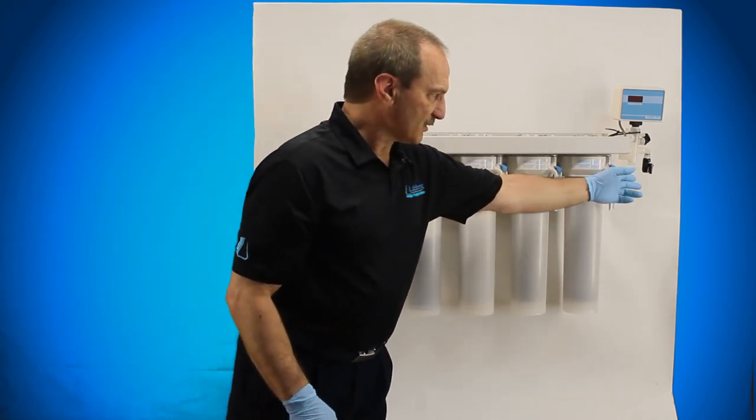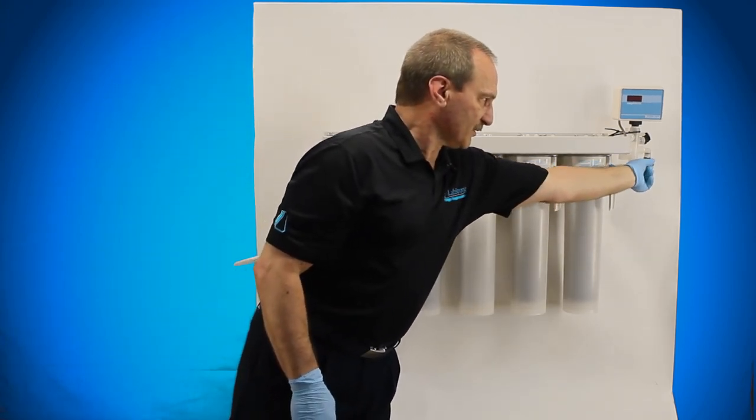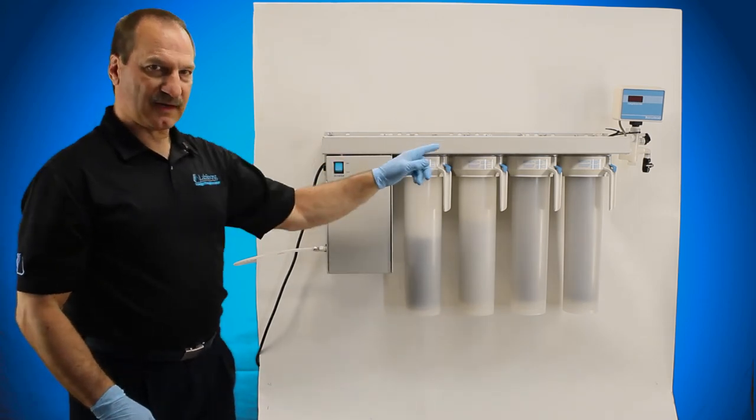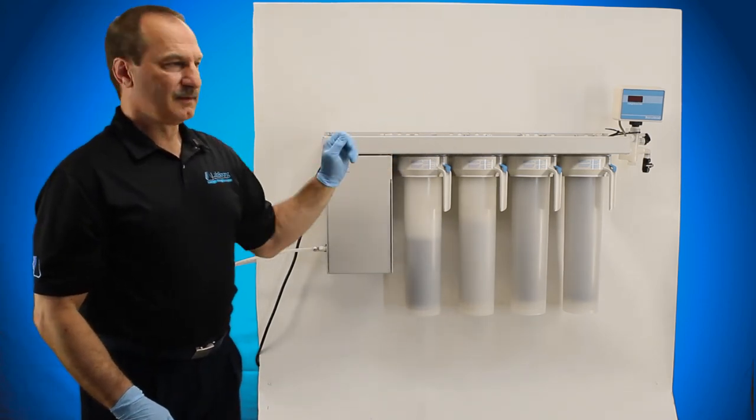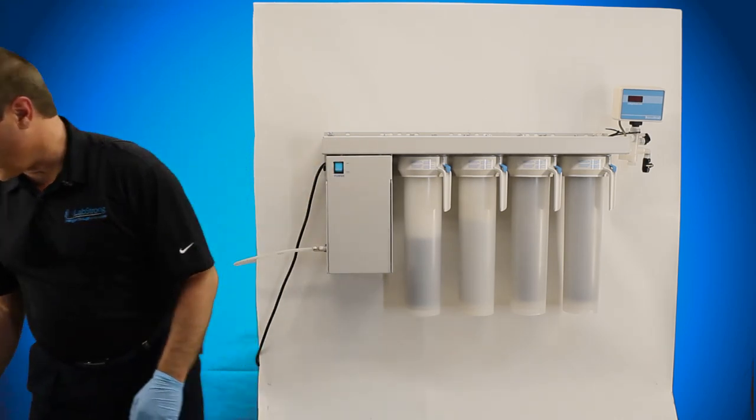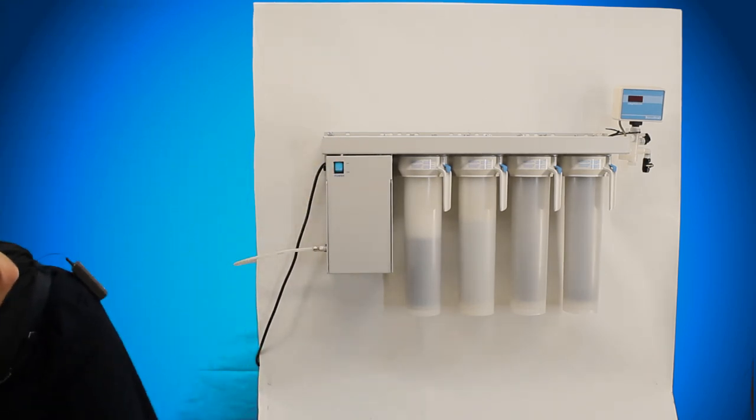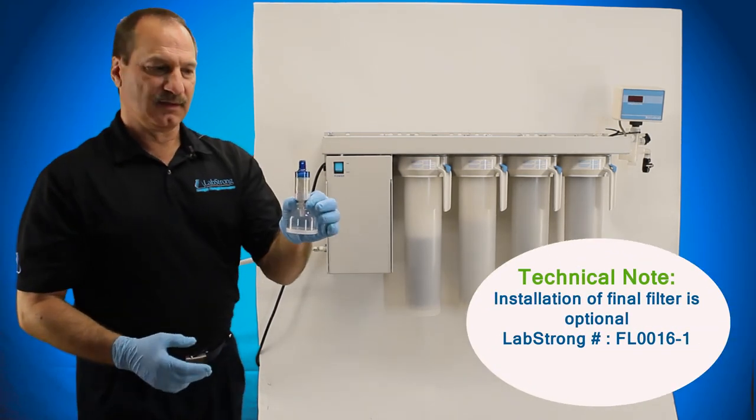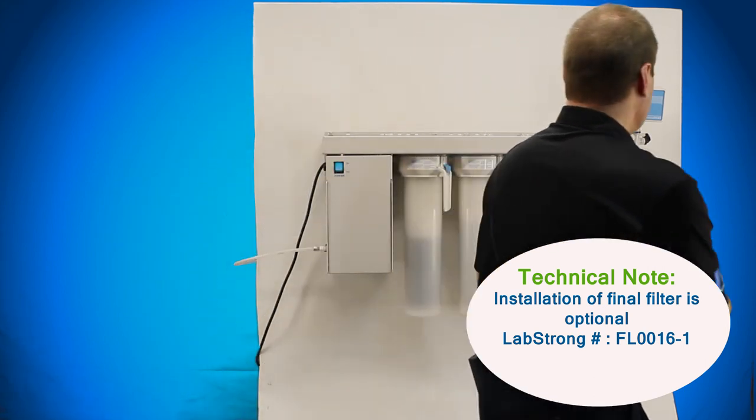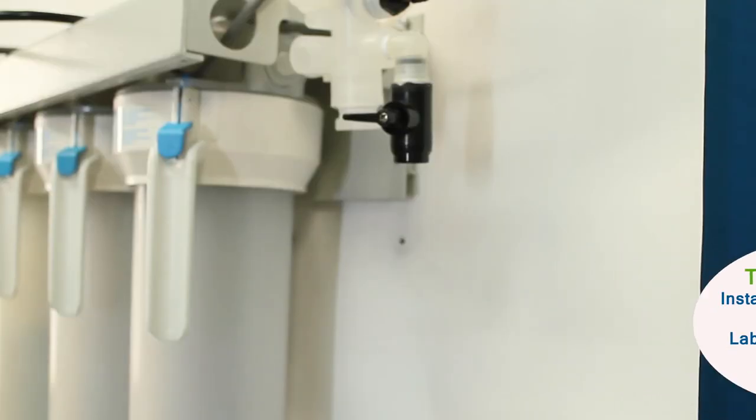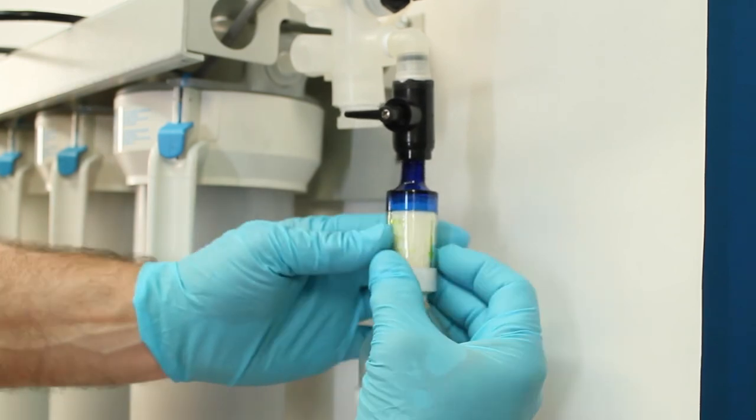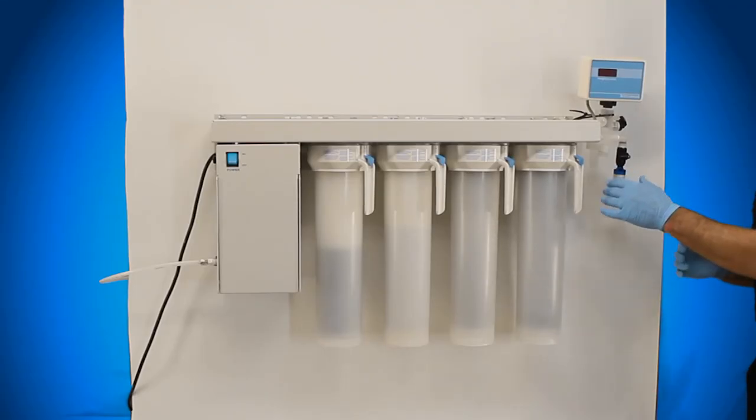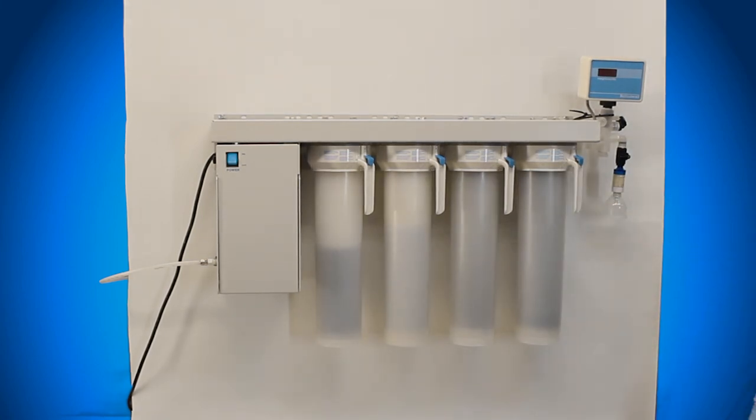Once all the air is out of the system, you can shut the valve off, and that system will go into recirculation, and your purity will start to drive itself up. At that point, when you've got to flush through, now you can go ahead and actually install your 0.2 micron final filter. This is an FL0016-1 that just threads in place. Once that's in place, you're ready to go and the system is ready to be used.